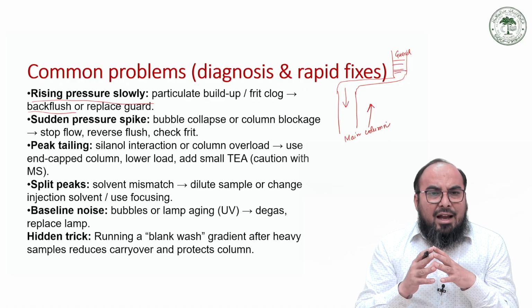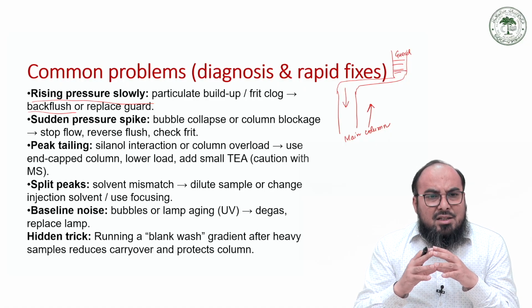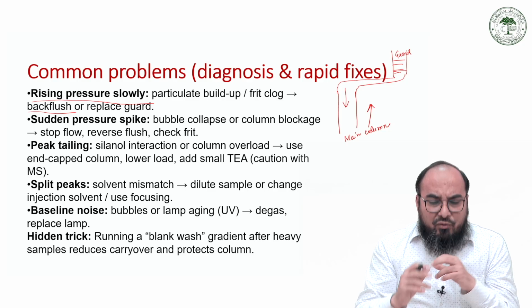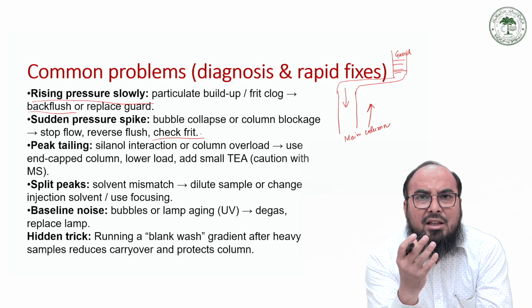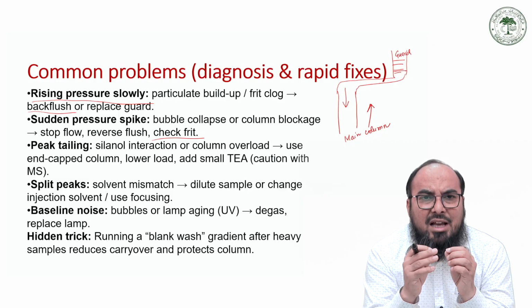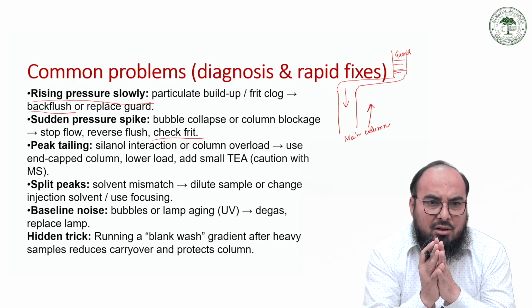Similarly, we have to check for sudden pressure spikes, and this may be because of column blockage. So we have to check our frit, whether our frit is clogged or not, whether our frit, which has very small pores throughout, has these pores open or not.